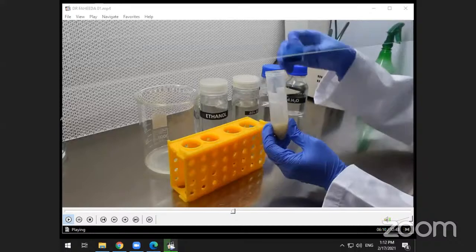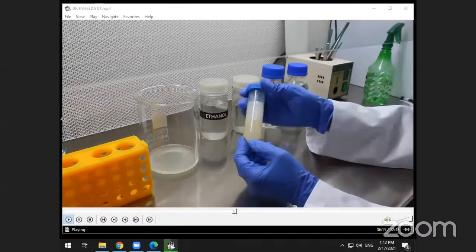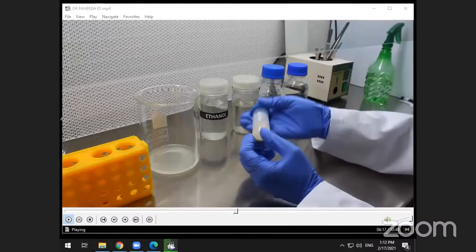And wash the seeds with autoclaved distilled water 3 to 4 times to remove all the traces of bleach and ethanol.